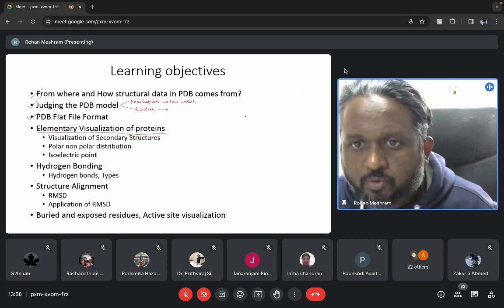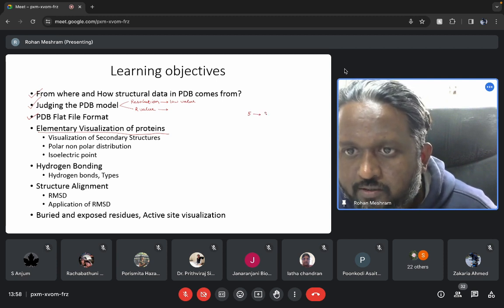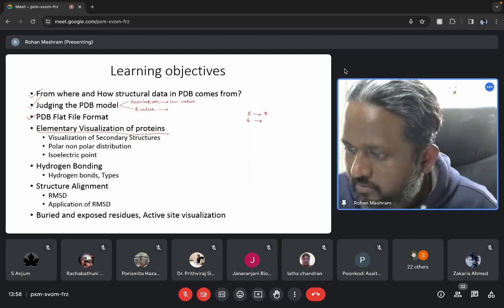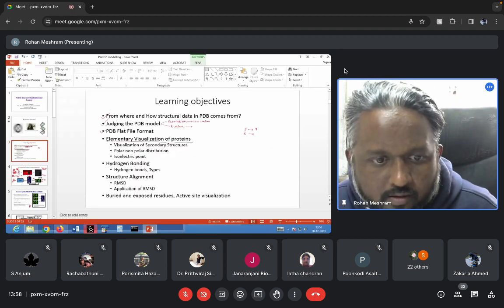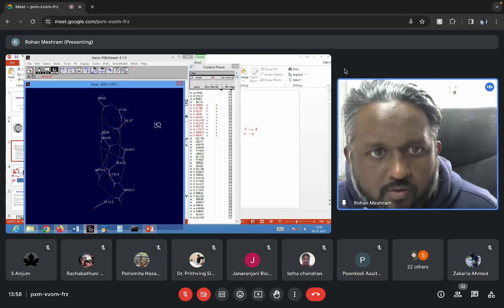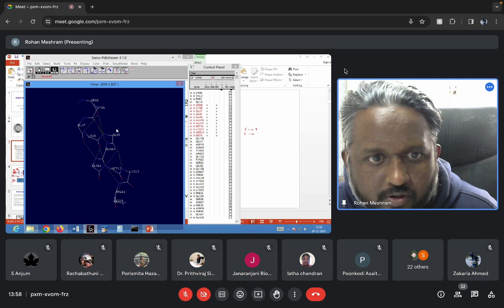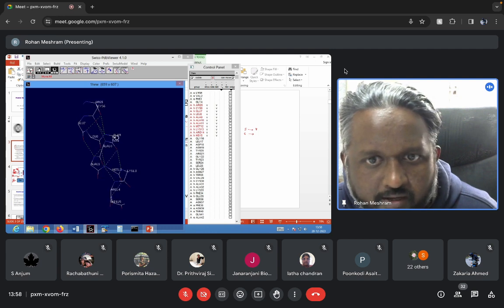What was the first hydrogen bond that we have noted? The 5th residue forms a hydrogen bond with 8. Well, now let us see what the 6th residue forms a hydrogen bond with. So now, the 6th residue is cysteine 6. The 6th residue, of course, will form a hydrogen bond with the 9th residue, something called alanine 9.